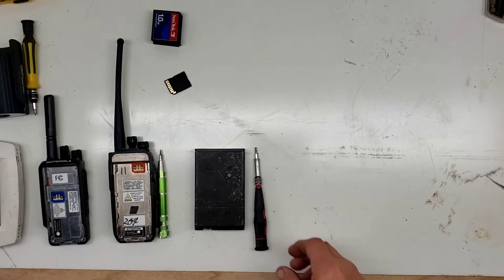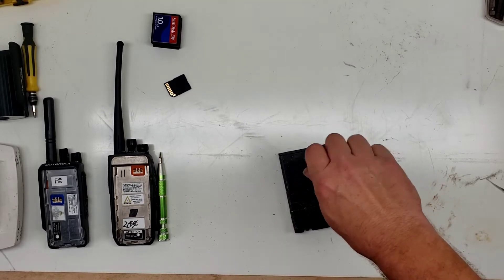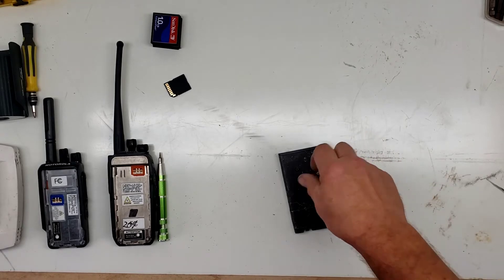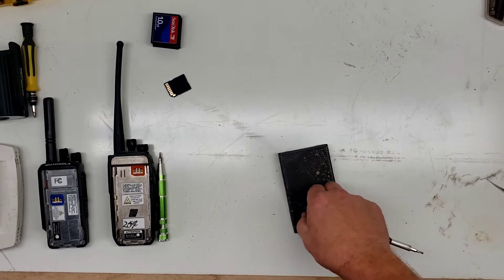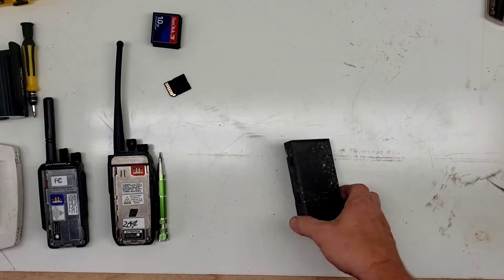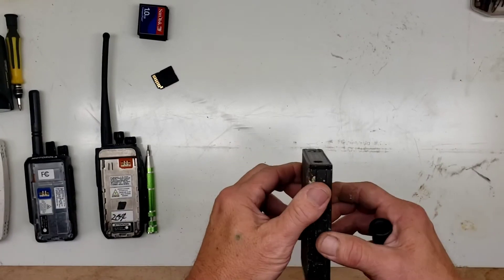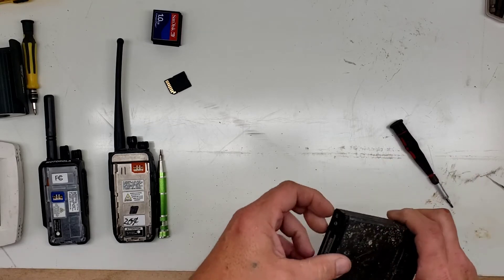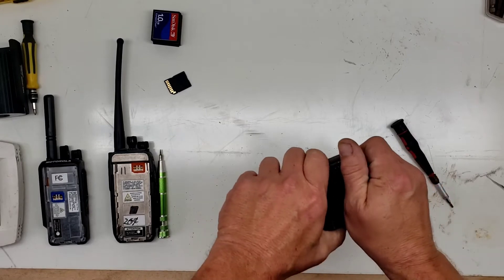Hello everyone. Not really sure how this video is gonna go - this is like a test run. I had this guy already done because the outer case was so torn up I didn't know if the screws would come out or not. So I don't know how far - whether you guys can even see well.